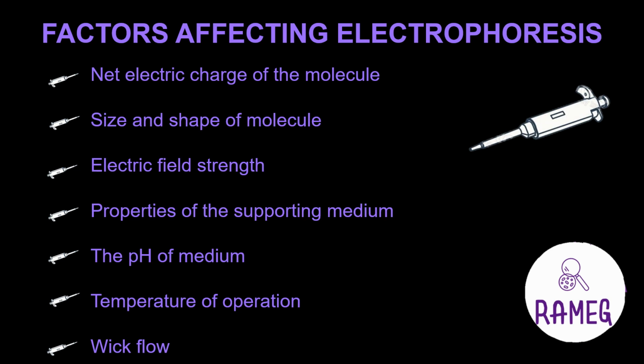Moving on to the wick flow, sample migration is dependent upon the width of the wick. So if the wick is too thick, the sample will take time to migrate.